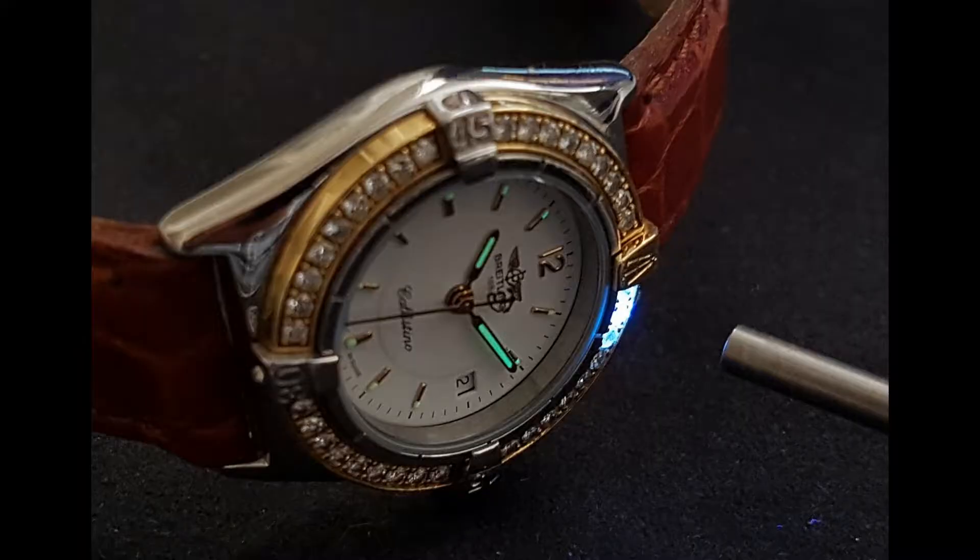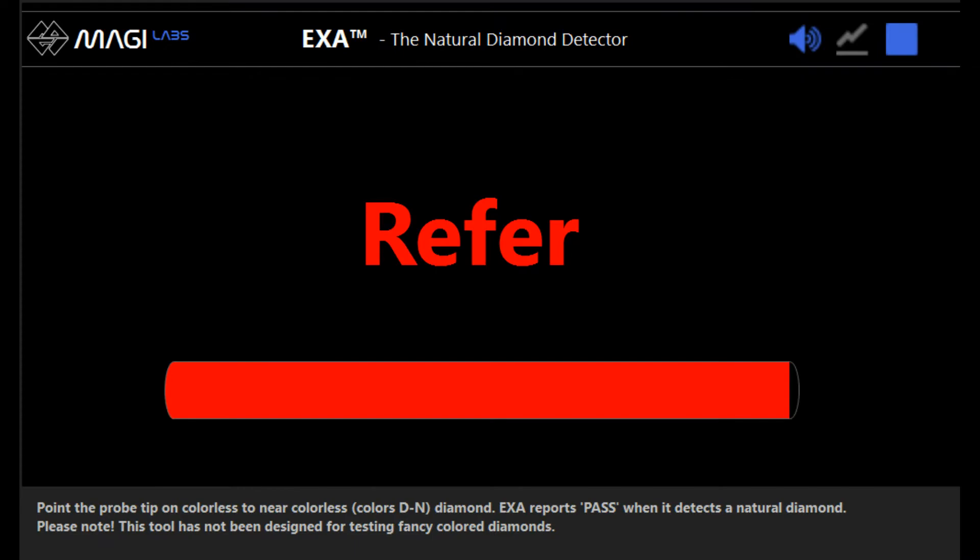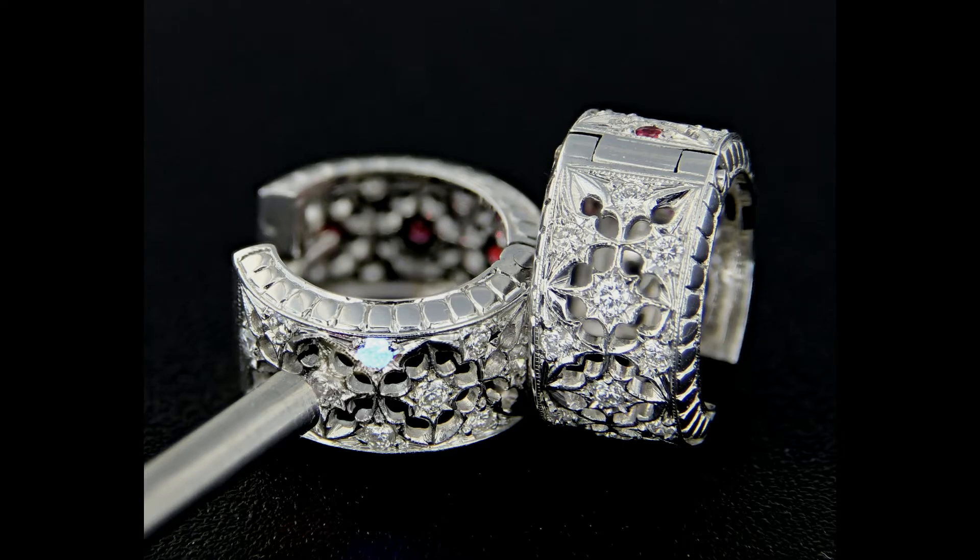Besides being an effective screening unit for diamonds in standard mode, it is provided by an advanced mode featuring the fluorescent spectrum for more in-depth analysis.